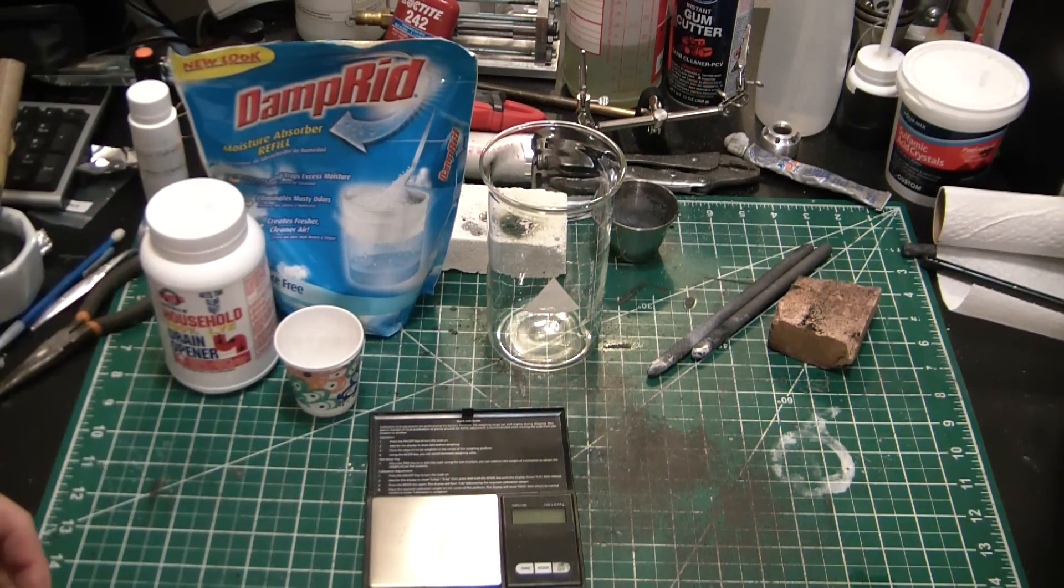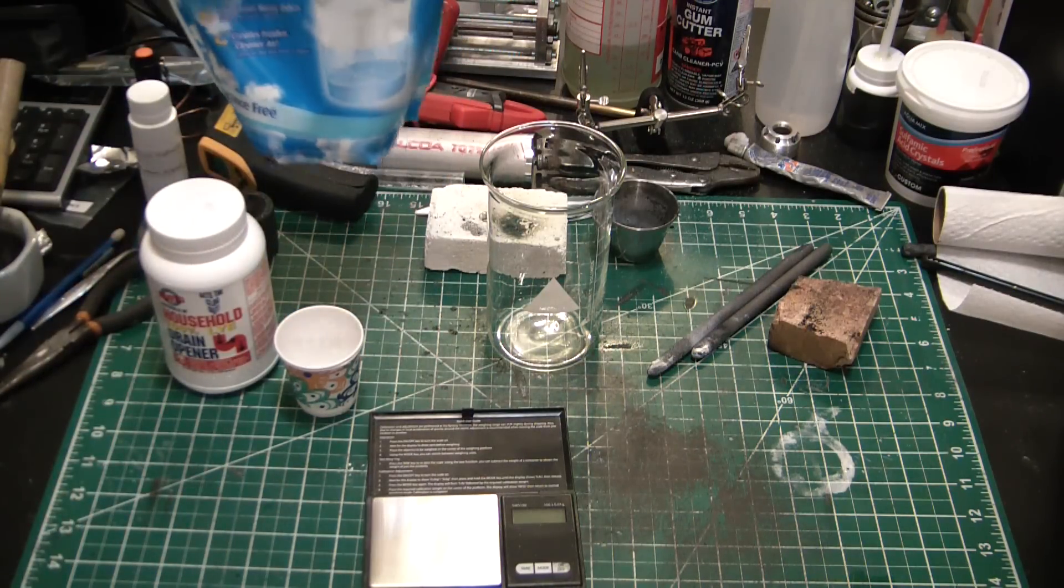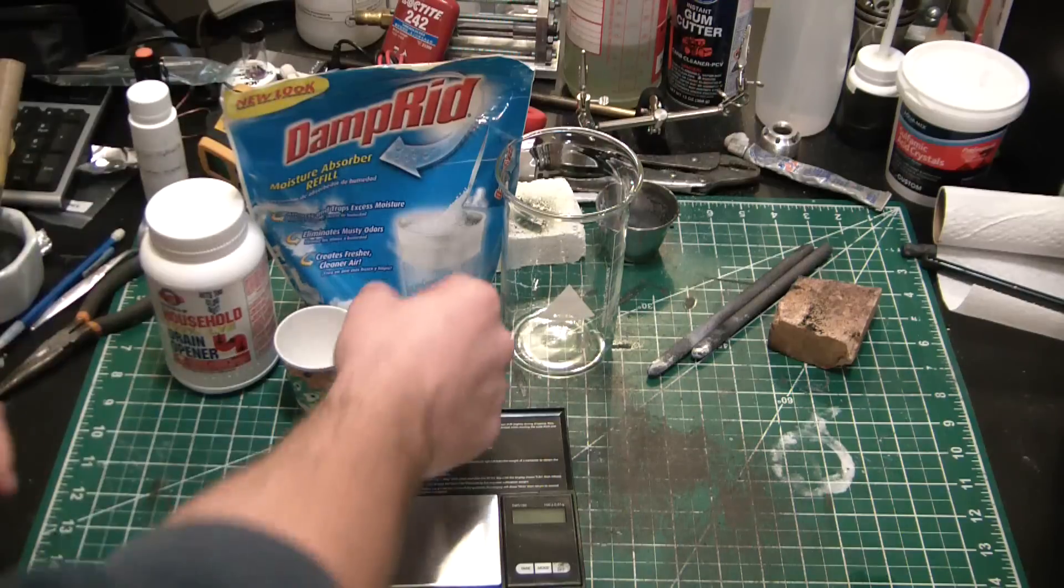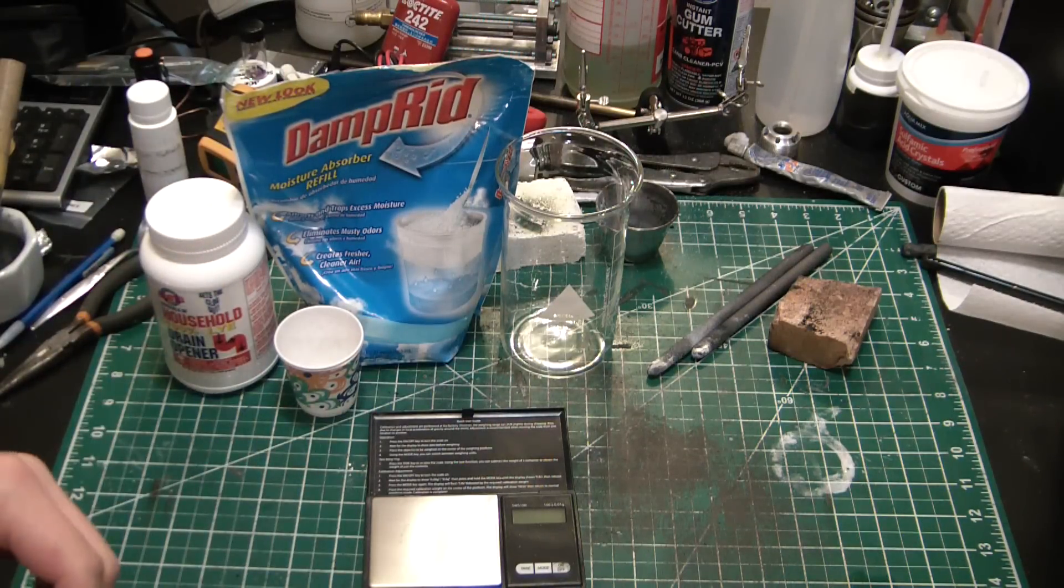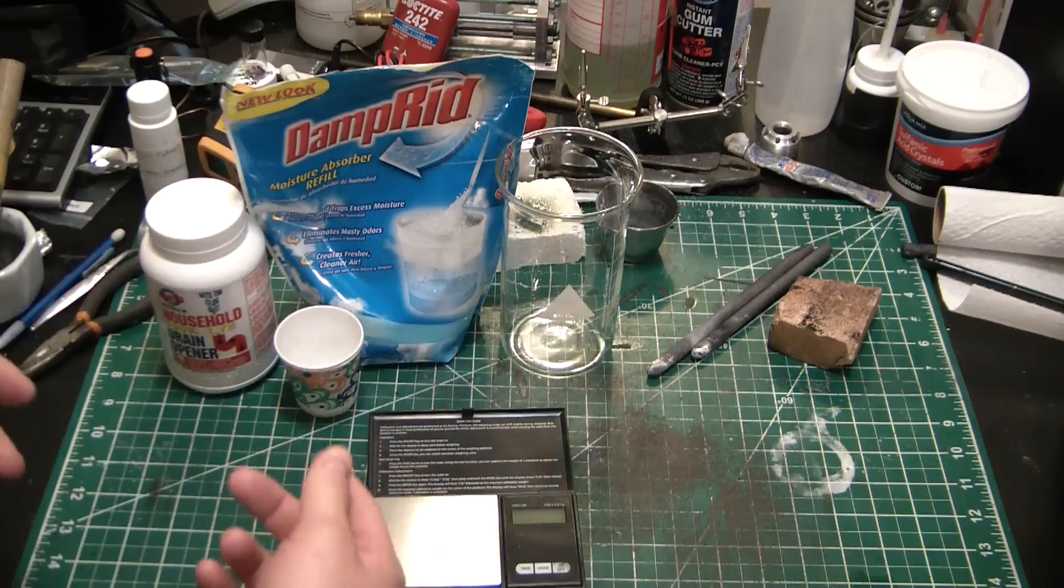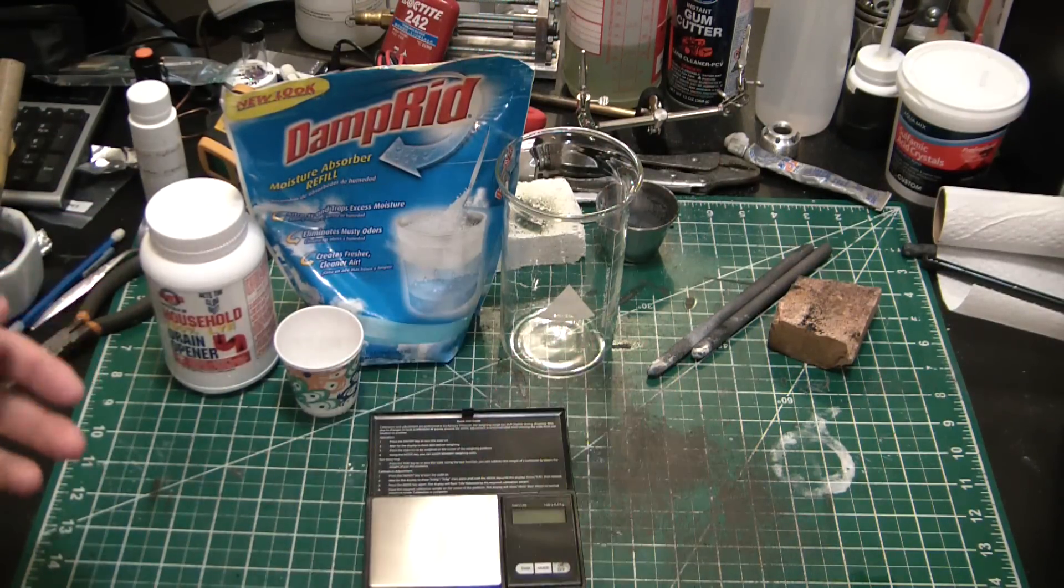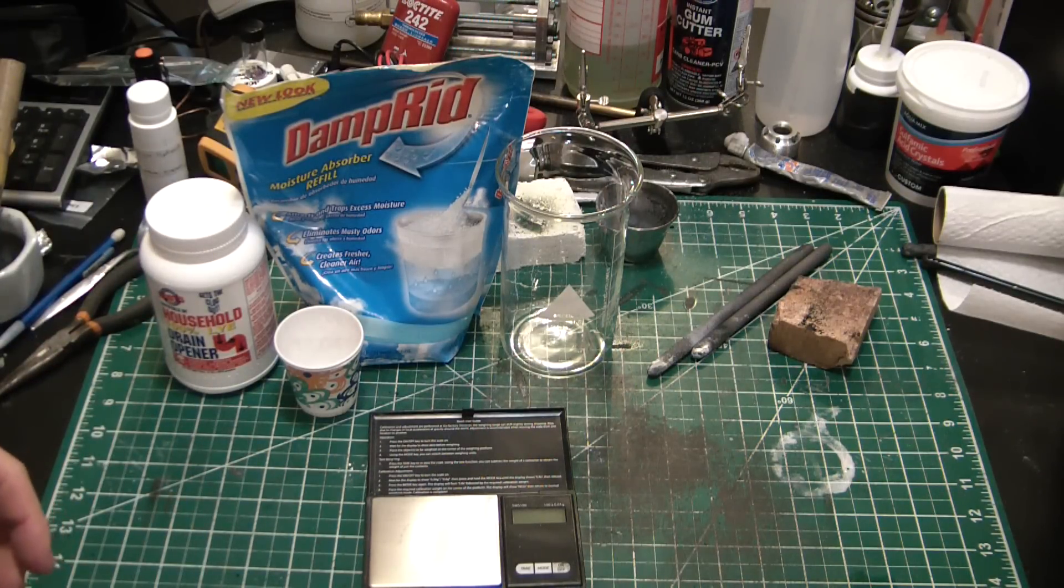What we're going to do is a 60:40 mass ratio of calcium chloride to sodium hydroxide. I'm going to double it up, get them both in solution, and then just do the quick double displacement right in here. Let it settle out, give it a couple washes, and we'll have some pretty pure calcium hydroxide at that point. So let's get to it.